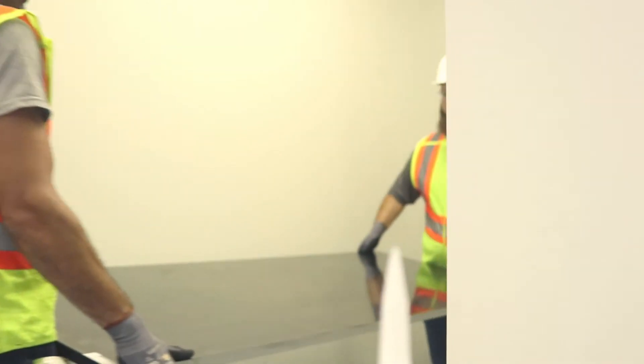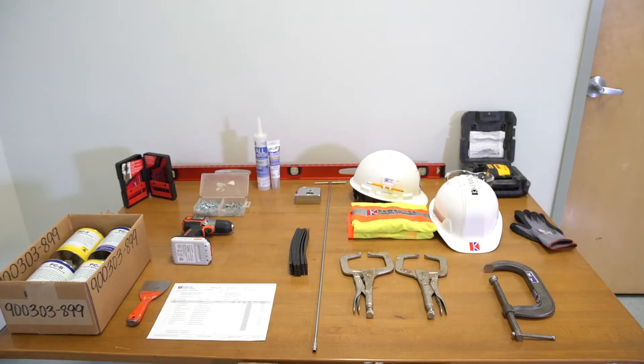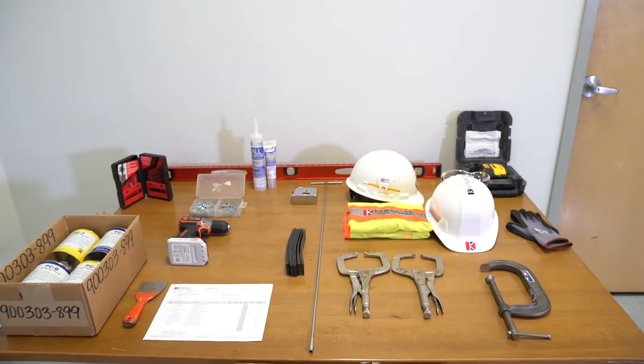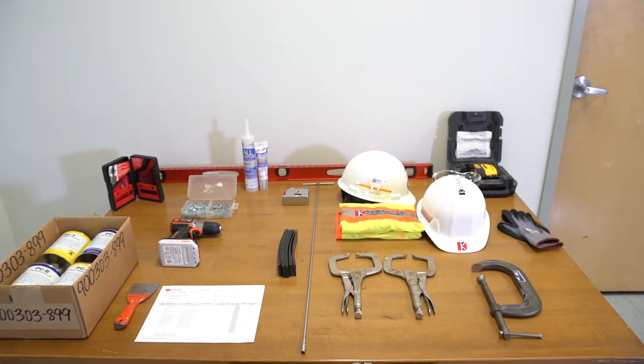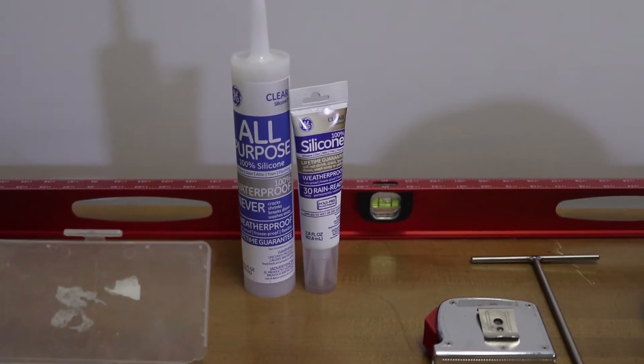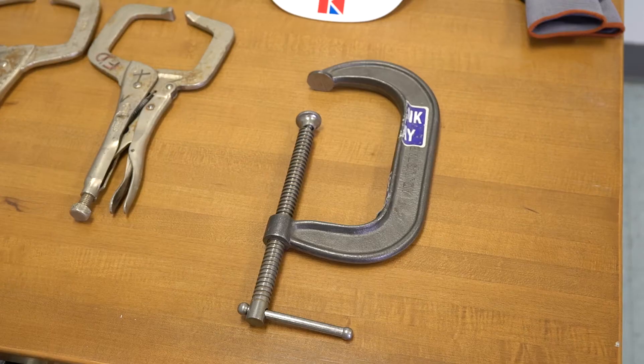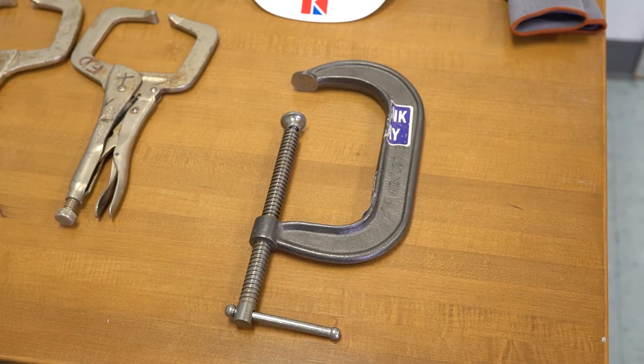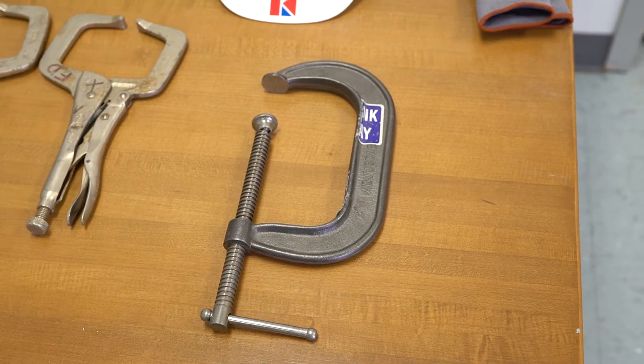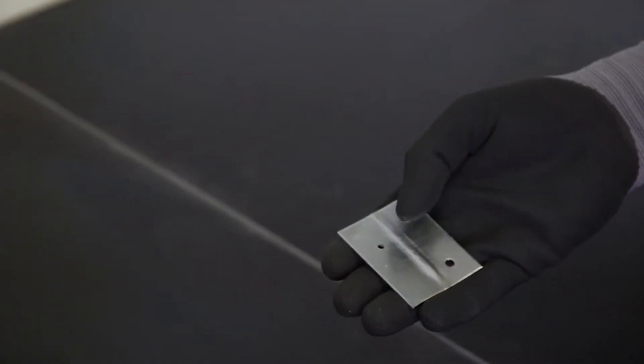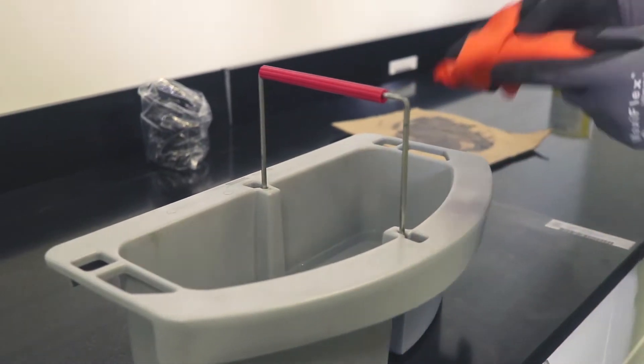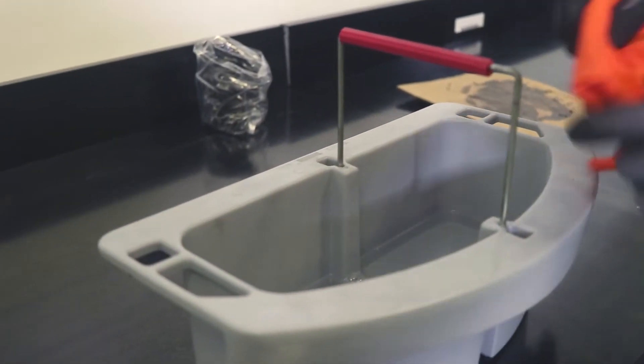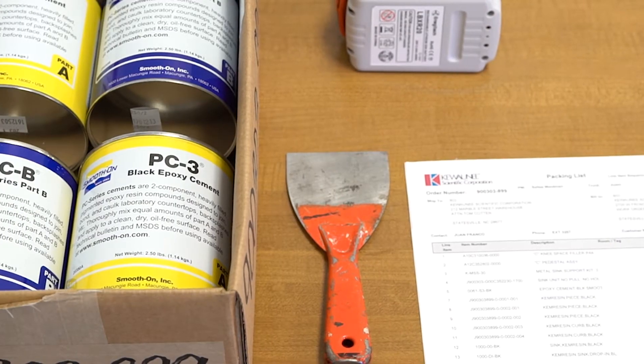To install Chem Resin, you will need the following tools and hardware. We recommend a carpenter's level, leveling shims, a minimum of 2 C-clamps, 1/16th inch thick spacers, 2 buckets with water and cloths, and putty knives.